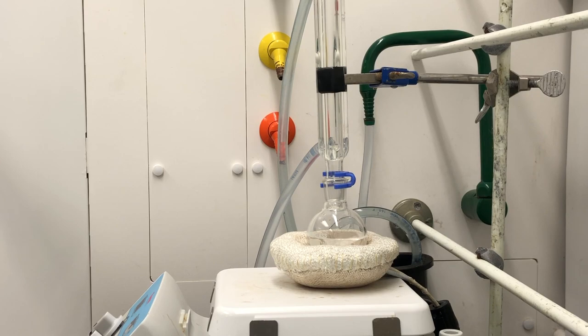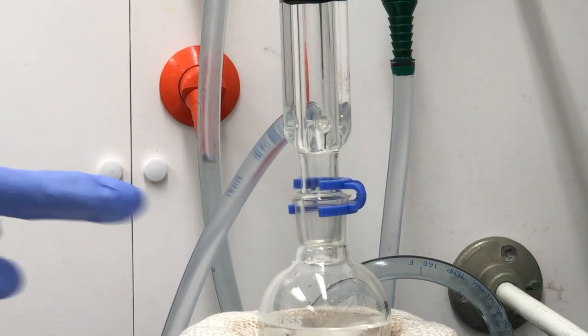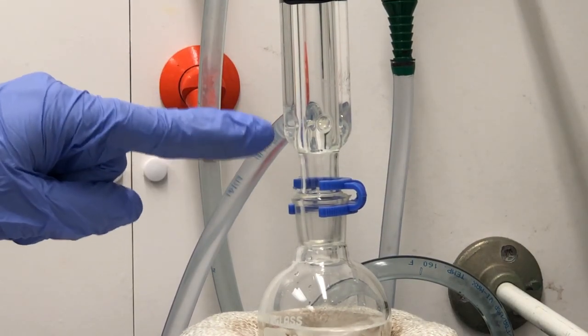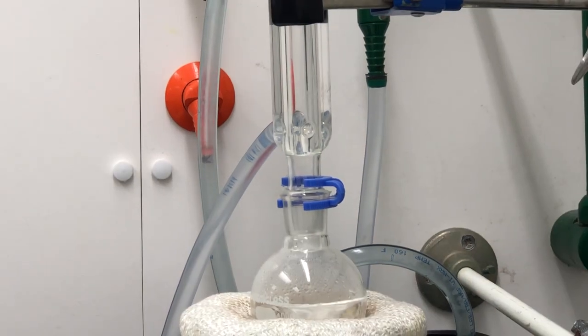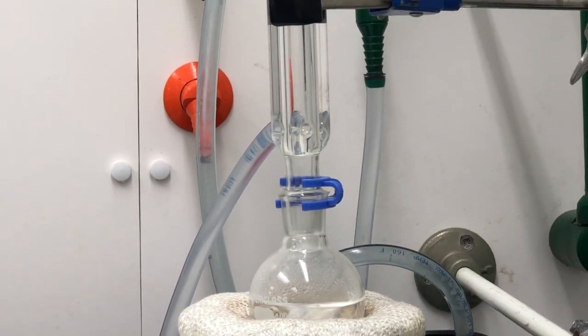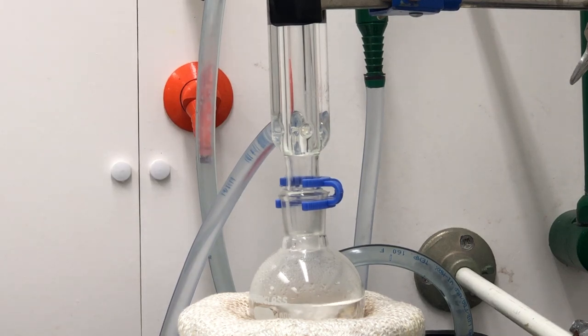We'll be able to tell that the reaction has reached reflux once we notice that the solution is boiling and that there is a condensation ring that has formed. So we'll keep an eye on that. As you can begin to see, it's the formation of condensation right within the round bottom flask. We haven't yet observed a condensation ring, so we can't really start the time of reflux yet, but we should be close.